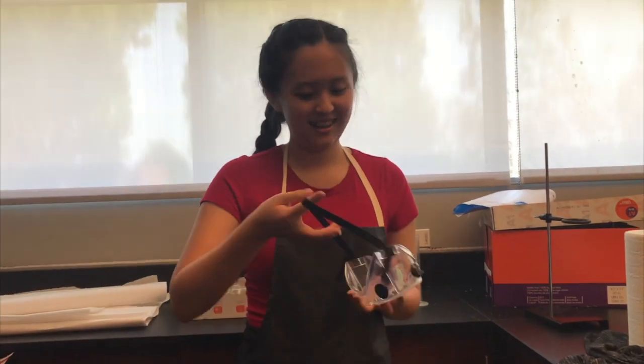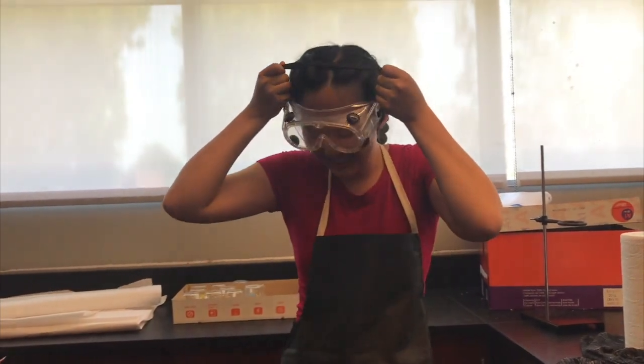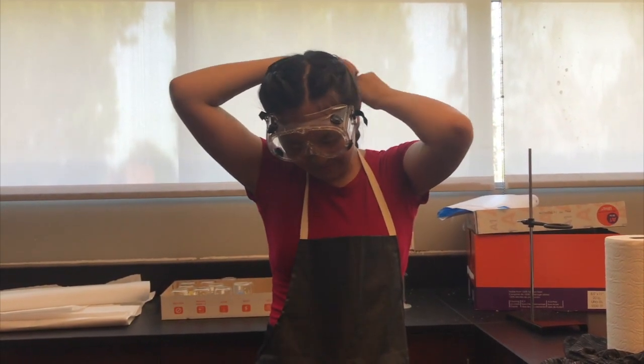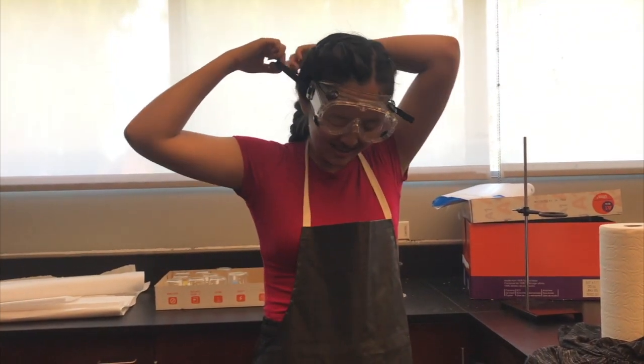You need some goggles. Lab goggles are so important. And also don't forget to tie back long hair. Make sure that loose clothing or dangling jewelry is secured, or avoid wearing it in the first place.